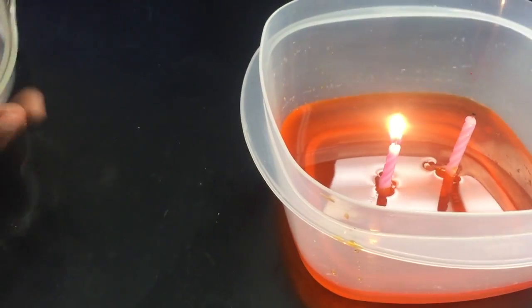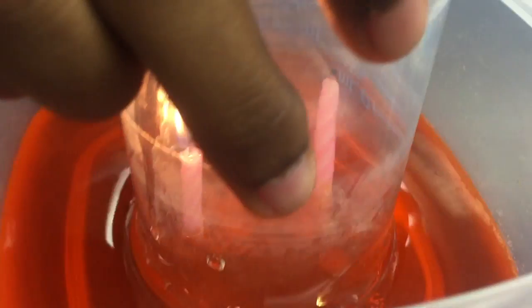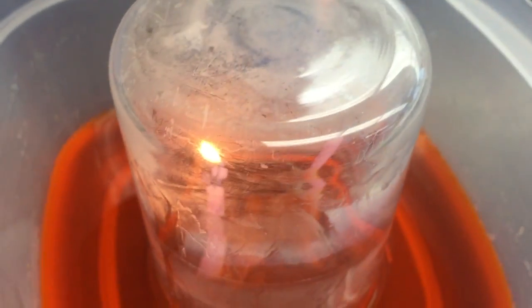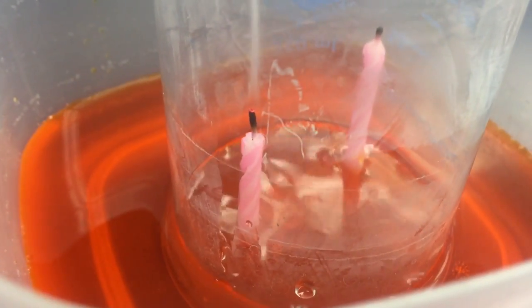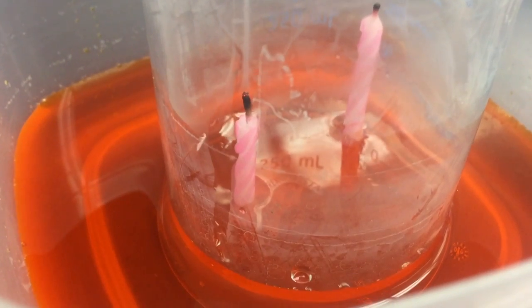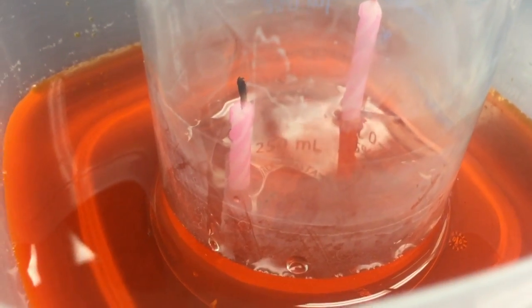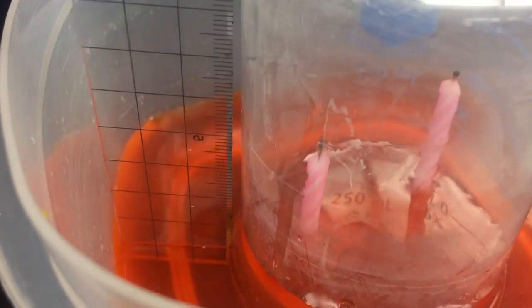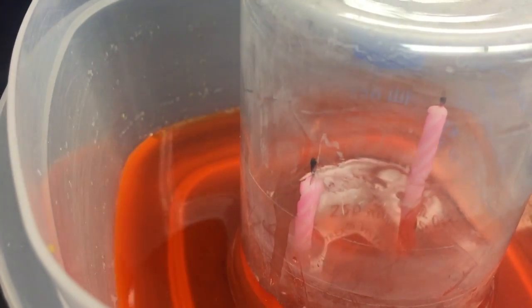Okay, so now that the candle is lit, we are going to cover the candles, making sure that the base of the beaker is fully submerged in the water. So as you can see, the candle is slowly going out, and now the water is starting to rise. So then we'll be using the ruler to measure how much water.